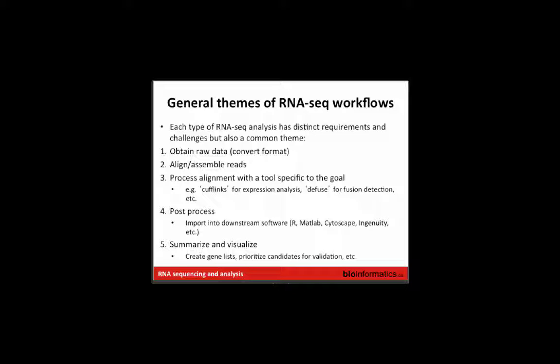They all follow this theme: you start with some raw data, and this could be in a FASTQ format or it could be in BAM format already. You're either going to align or assemble, or some combination, your reads. Then you're going to process alignments. At this stage, you'll get a BAM file. Then you're going to process alignments with a specific tool. Often the tools are specific to each of those applications.